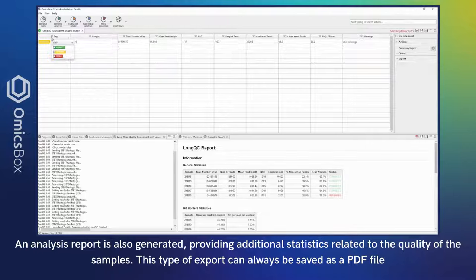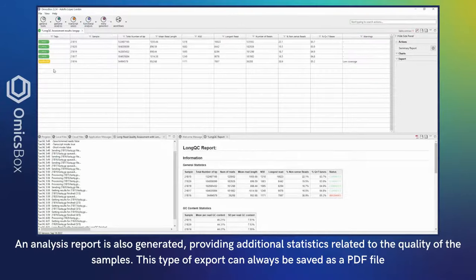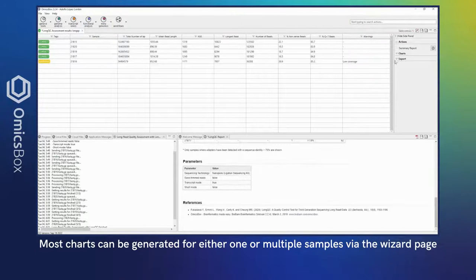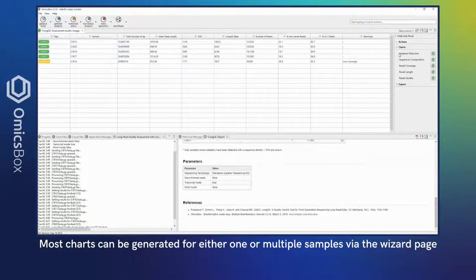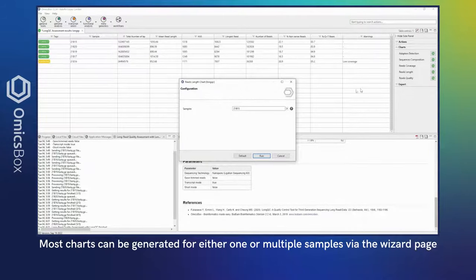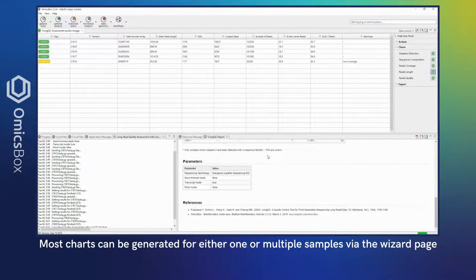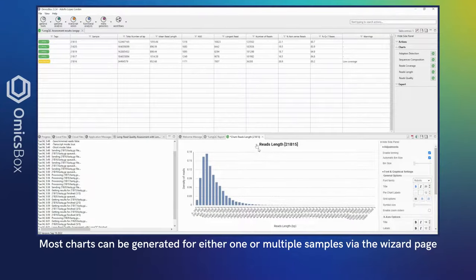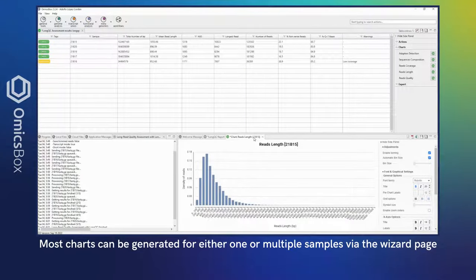Most charts can be generated for either one or for multiple samples via the wizard page. With a single sample, a histogram with adjustable bin sizes will be displayed.